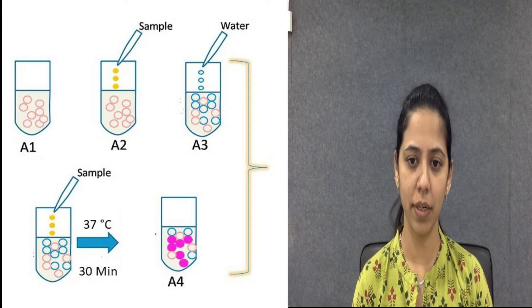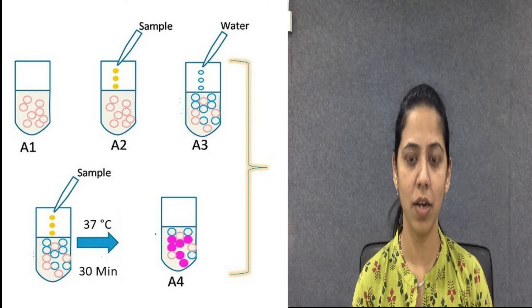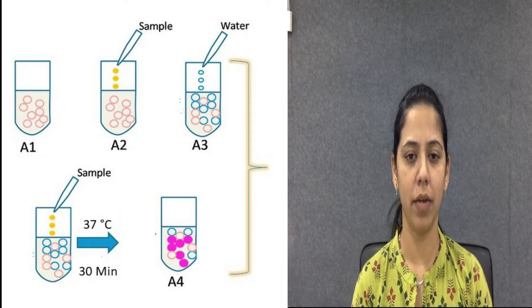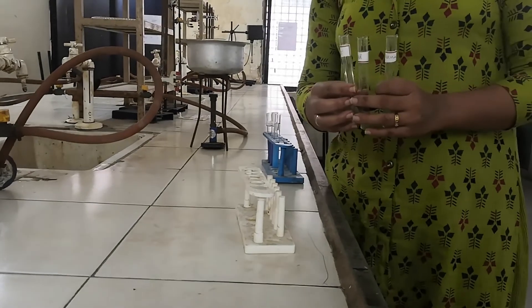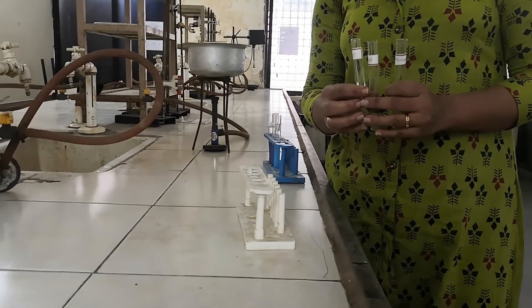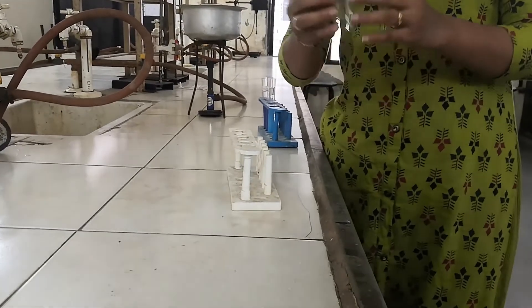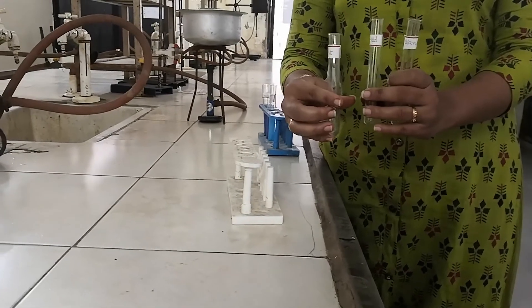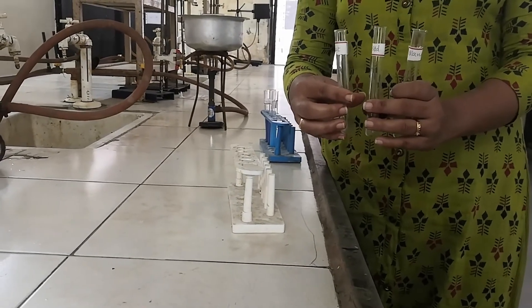In each test tube add 5 ml of Biuret reagent and maintain all test tubes at 37 degrees Celsius for 20 minutes. Then measure the absorbance of the test and standard at 520 nanometers. First, take three test tubes, wash thoroughly with water, dry them, and label them as test, standard, and blank. Then add all ingredients as given in the procedure.